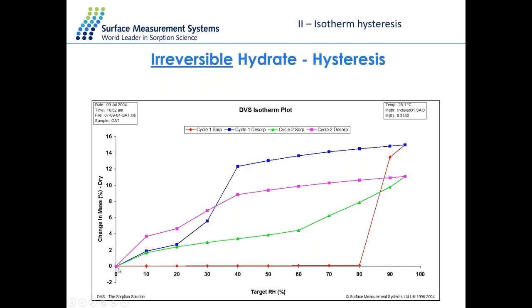I can dry it back, but then whenever I put any more water into the structure, the sample goes back up. It doesn't have that nice surface absorption that I had when the material is fresh and as prepared. It's lost the stability that it used to have in the initial cycle. So that's something that is very important for the study of stability and storage condition of this type of material.